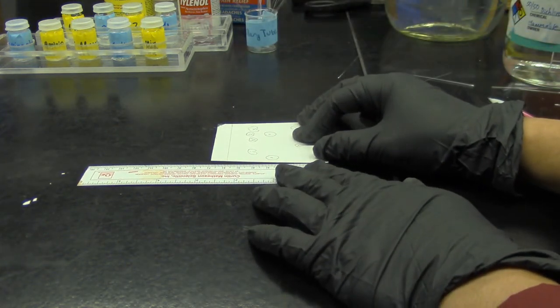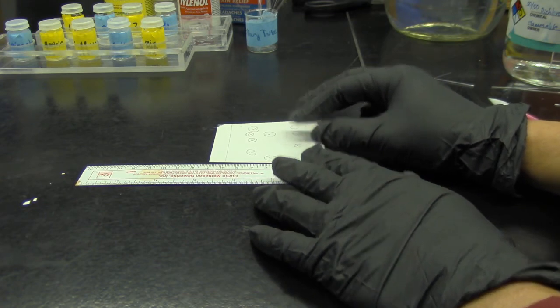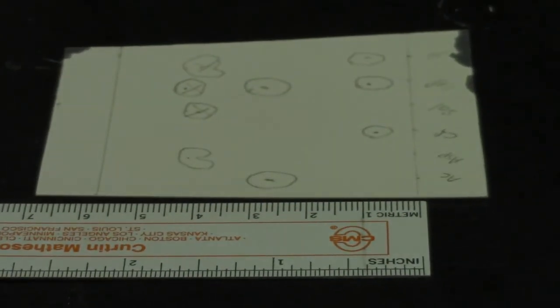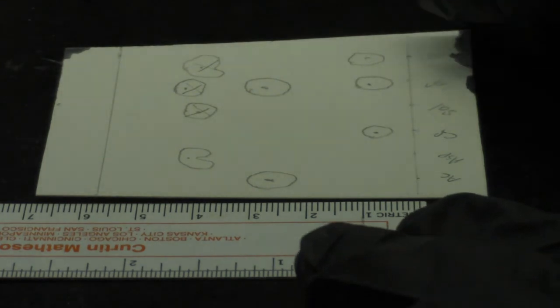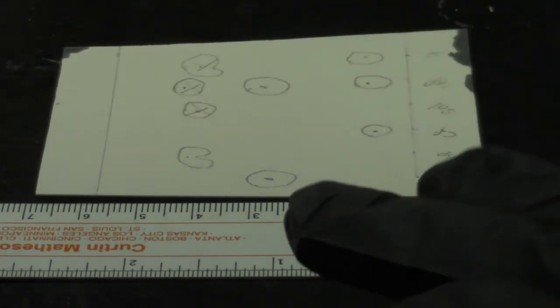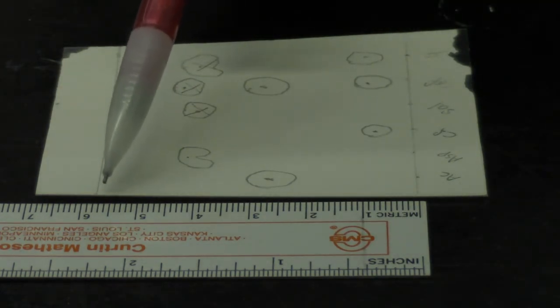So using the ruler here, I'm going to line them up and try to zoom in. Okay, so measuring the solvent front first: 5, 6, 7.